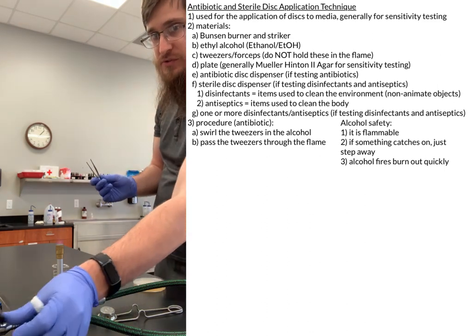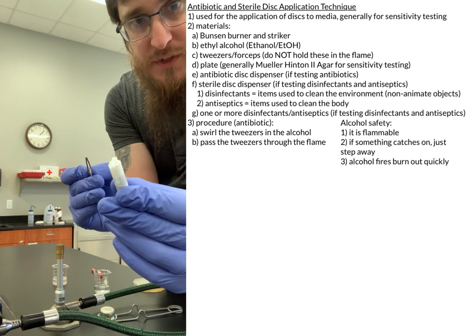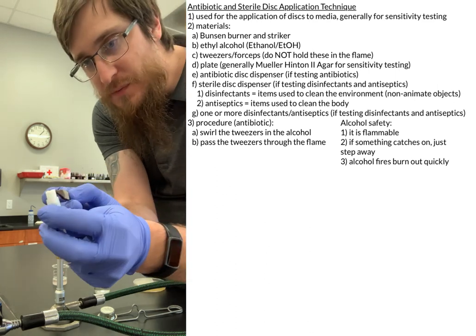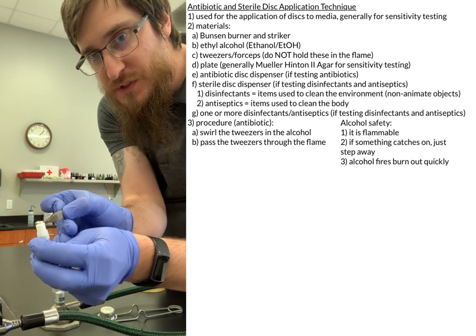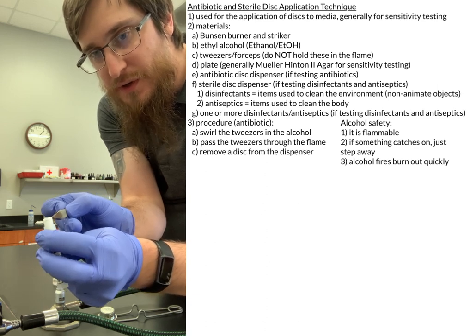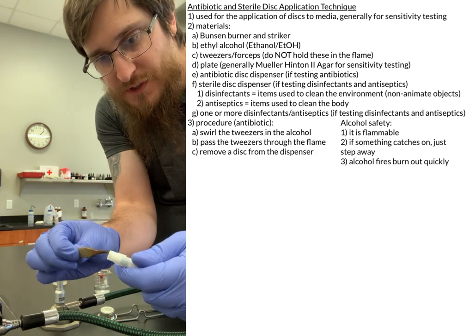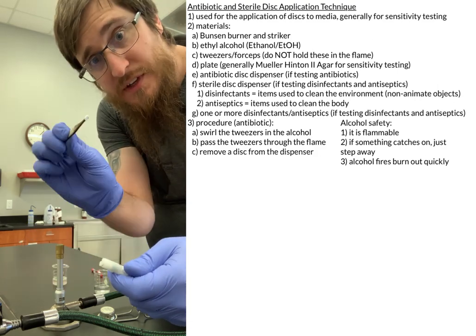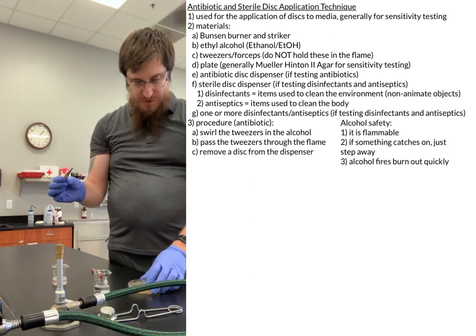So I'm just going to go ahead and turn this off for a second. What I like to do, again, with that tiny little disc in there, is on one side, you can kind of push the disc a little bit so that it comes out. And then on the other side, you can grab the disc and now you have it. And let's see, this one was penicillin.